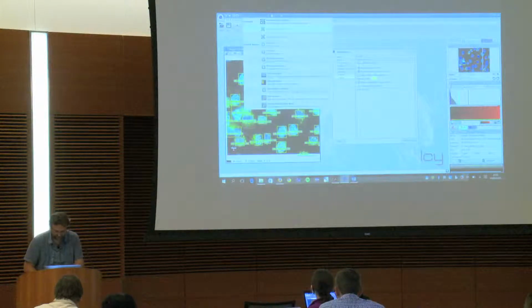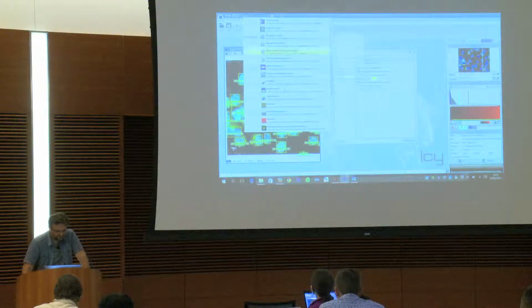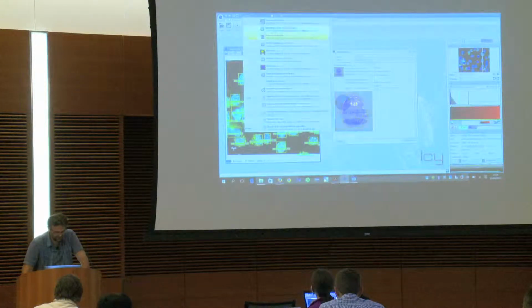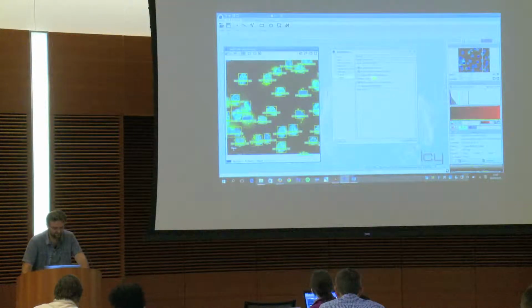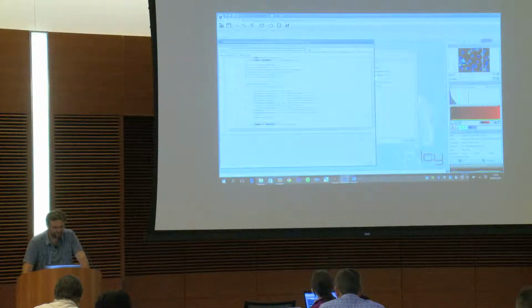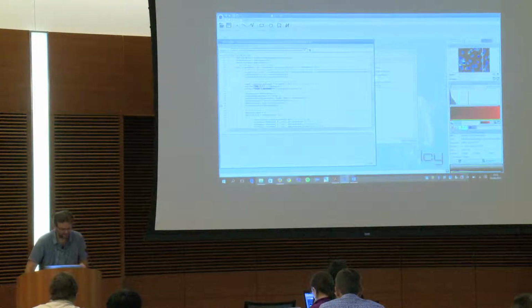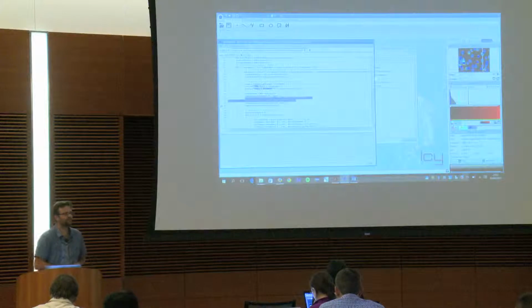So I won't write a plugin for you, but I will write a script. And then here you go to the resources, online plugins, and here you have the script. So if I want to detect the spots and change the parameter in time, I just click on it. I wait a bit, and now this script has been downloaded from the web. And we have here access to the detection that you saw. It is this line, detector.detect things in the sequence. But then you can add extra code to add your extra feature and not break the continuity or reproducibility of the GUI.